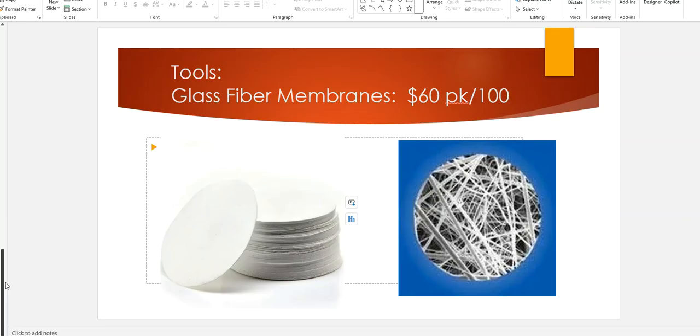So anything that's dissolved will normally make its way through this glass fiber filter, and the larger particles do stay behind, but again, keep in mind that the holes are very varied. So the majority of that sample can possibly go through. As long as it's dissolved, it will be able to escape.